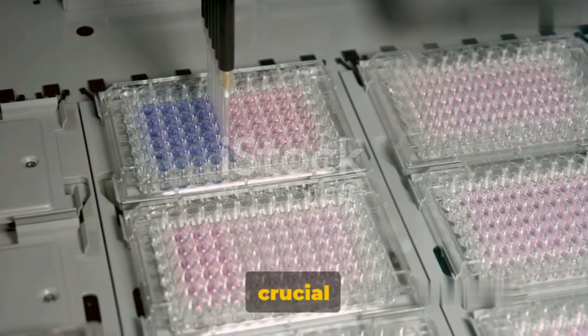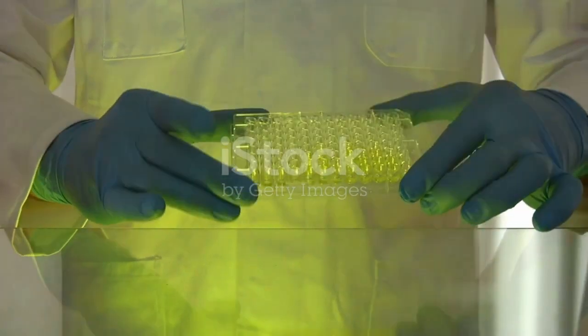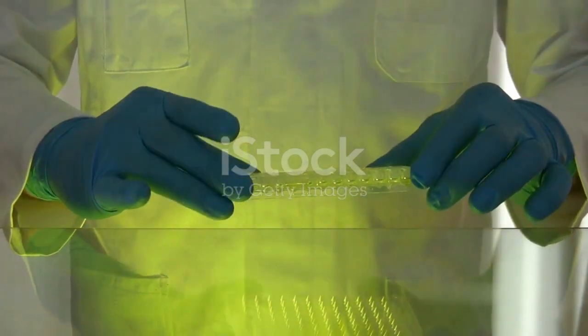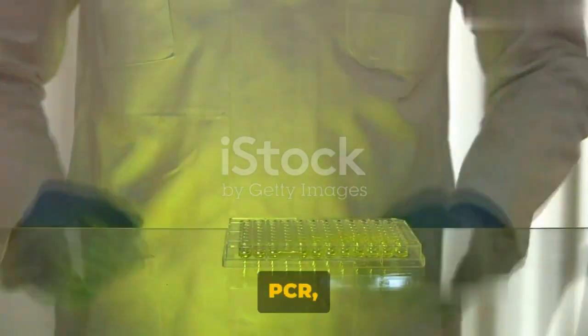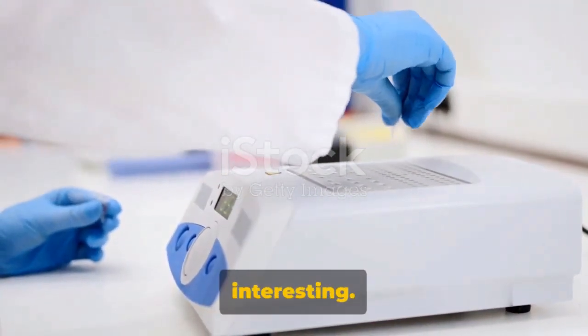Detection, the second crucial step, is where real-time PCR truly shines. In this phase, the magic of fluorescence technology comes into play. But what is fluorescence? Picture this. It's like a glowing marker that lights up under certain conditions. In real-time PCR, this glowing marker is added to our DNA sample. Now, this is where it gets interesting.